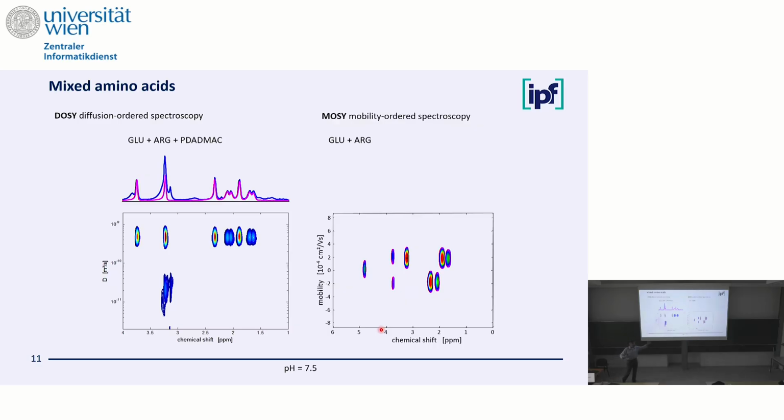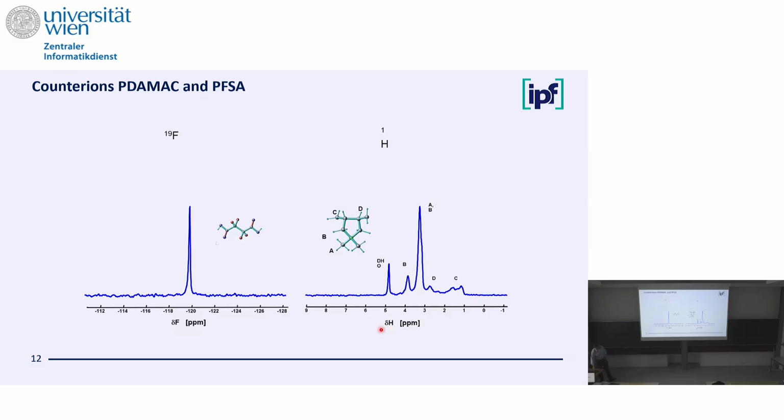I don't want to separate spectra, I want to get quantitative, but I want to show that I do not need fitting or whatever, it's straightforward. We'll transform to get. Okay, now maybe back to something I did some time ago.